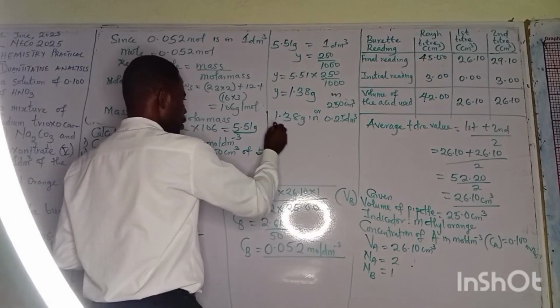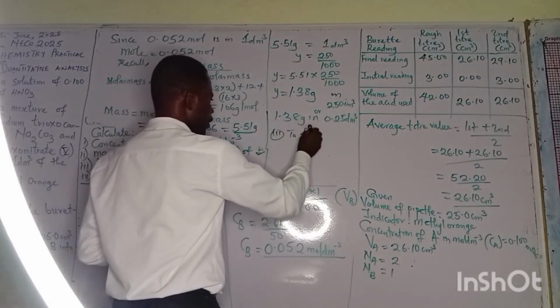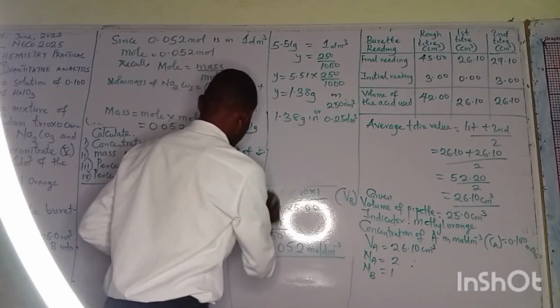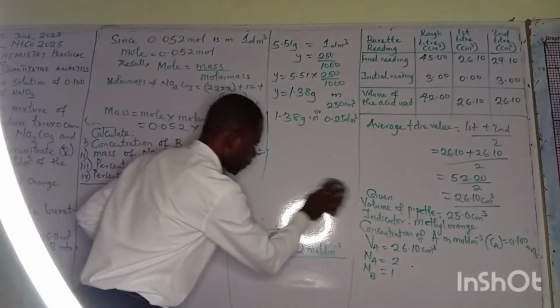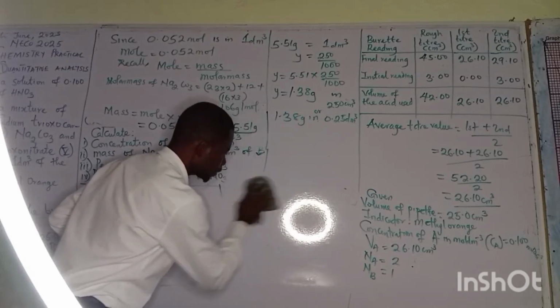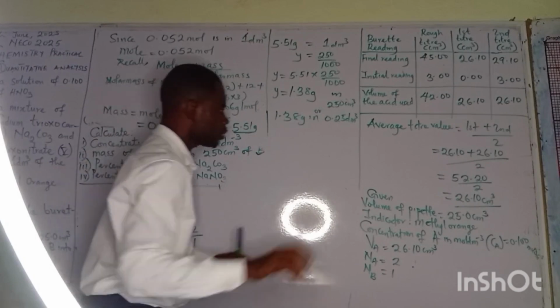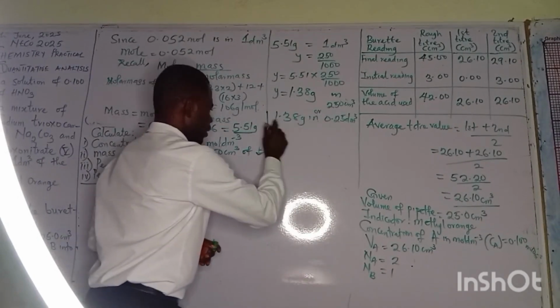So that's what I want to do right now. I'm doing number 3 here. Let me use somewhere clearer so that we'll be enjoying it. Please don't skip, do well to watch your video, so I'll be able to understand what we are doing here.